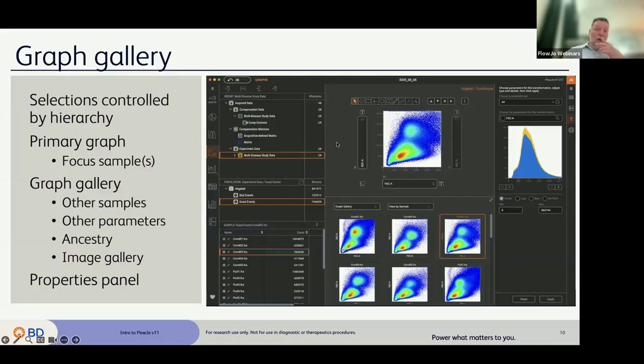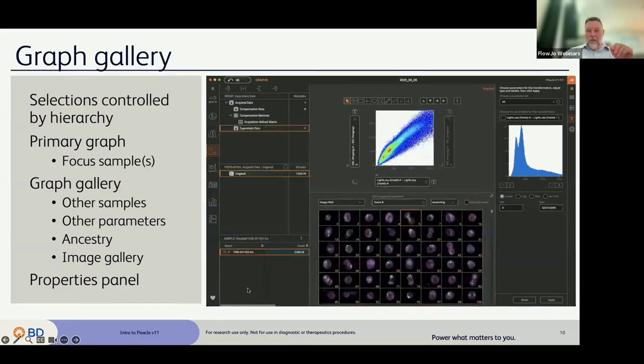Another cool thing about this last release is there are hotkeys now available. While they are a little bit different than the V10 hotkeys some people might have adopted, there are a lot of options. So you can now use hotkeys to scroll through the X or Y or the color axis over here when I turn this on. It's pretty cool. So let's see, do I have a video here? I don't think so. It's just the next context.